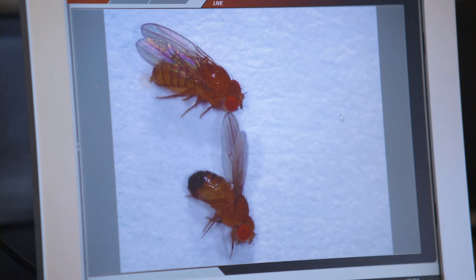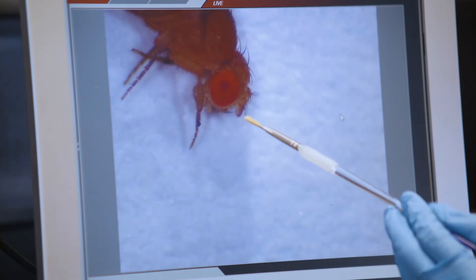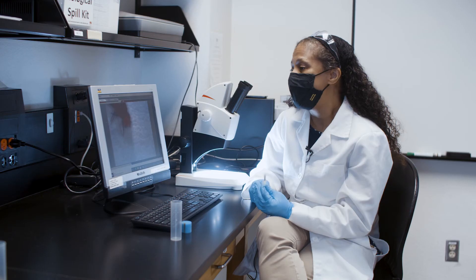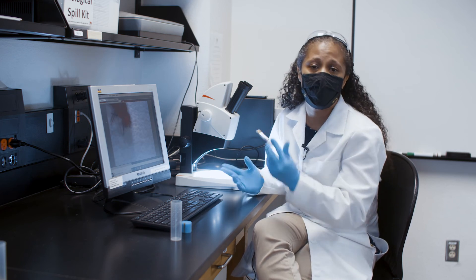The other thing you can see — let me zoom in a bit — is on the male you'll see this little black splotch, a little black piece of tissue right on the front legs where you would expect the fly's wrist to be. If you see that little black piece of tissue you have a male, guaranteed. These are called sex combs, which the male typically uses for copulation, and it's not a very variable phenotype. There are very few mutations that will influence the presence of the sex combs — unlike size or pigment intensity, the sex combs are relatively unaffected.